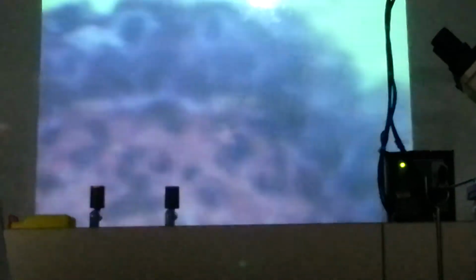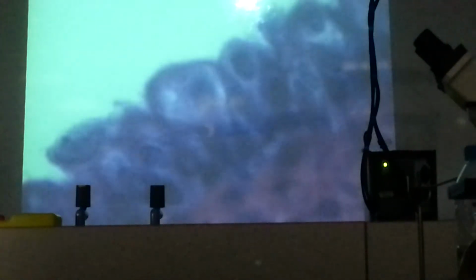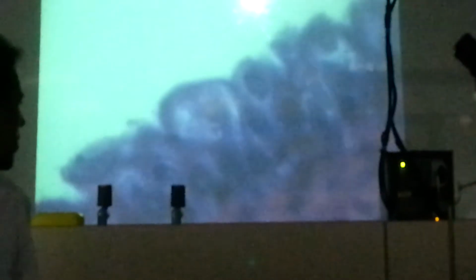What do you think? Do the cells have a dome-shaped surface or apical part, which characterizes the cells forming the top layer in transitional epithelium? Yes. What is this type of epithelium?